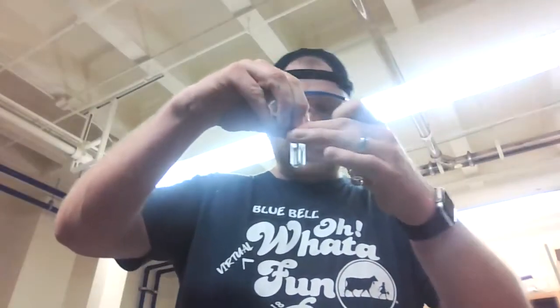I'm going to do this for all 4 of the spectrophotometers so I can get a baseline for all of these different instruments. I can use that to evaluate my fractions that have come off my column and say whether or not there's protein. I have blanked all my spectrophotometers.